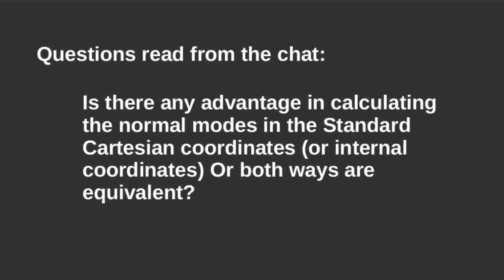But again, I'm not a specialist, and I'm not sure that this is better or worse than using Cartesian coordinates for normal mode analysis, because normal mode analysis is a simple method. The way we are using it, the Cartesian method, is a standard diagonalization of the full Hessian matrix.